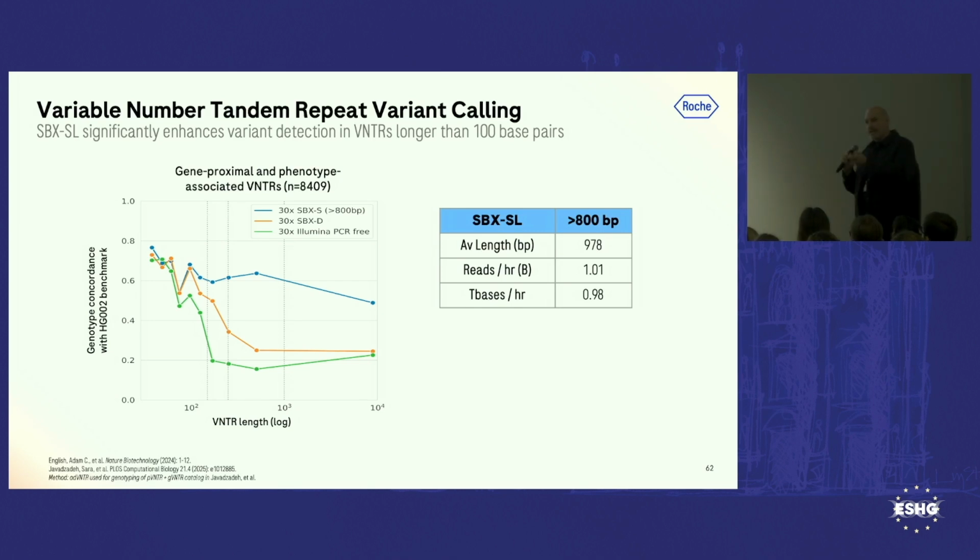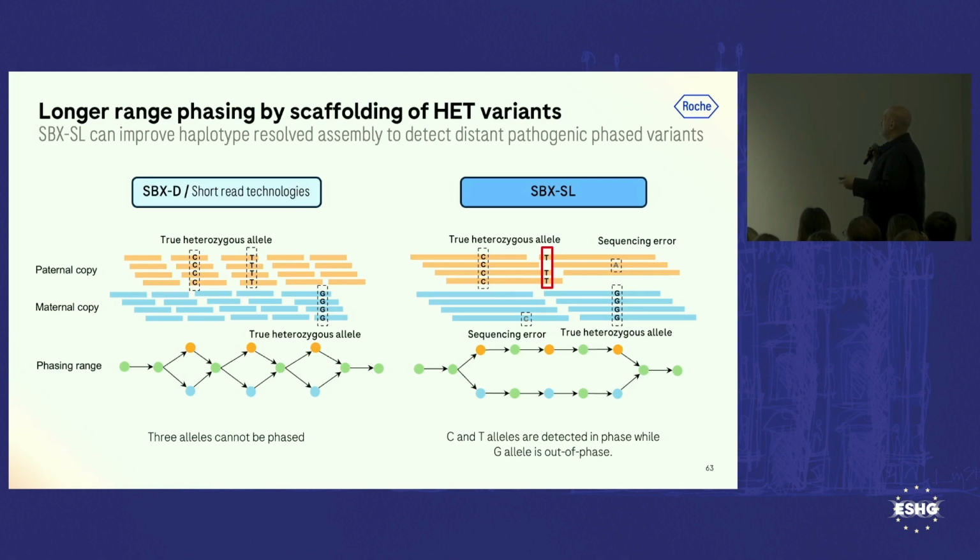Obviously, we're going to keep pushing the length up beyond the 1,000, go to 1,500, be able to get better phasing as you get longer. But this is all pretty new stuff that we've only just started working on.